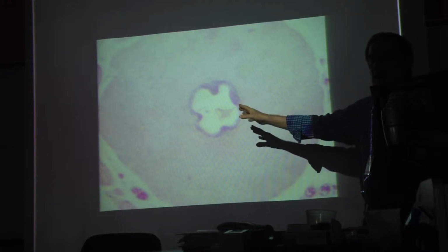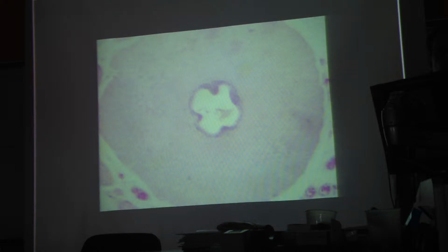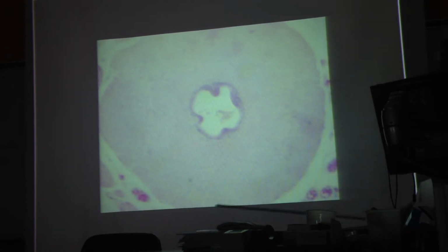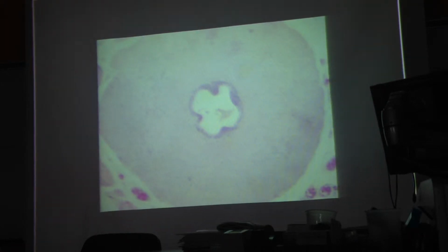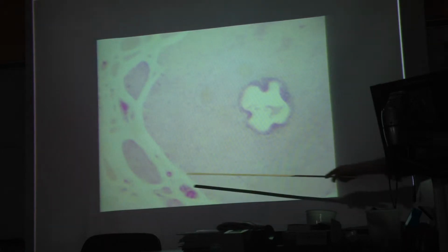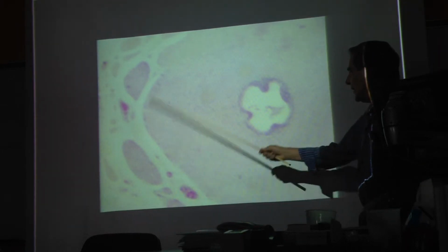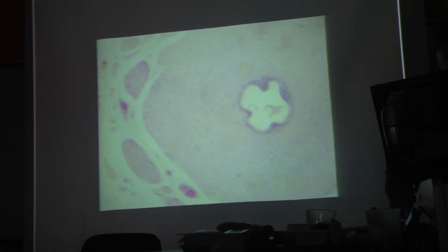This is only one of several components that we see in the spermatic cord. You've also got blood vessels there. You can see it on here. You've got nerve fibers as well, not a connective tissue. Nerve fibers over here, these are blood vessels, not a connective tissue. The prominent feature here is the ductus deferens or vas deferens. That's a tube that physically carries the sperm.